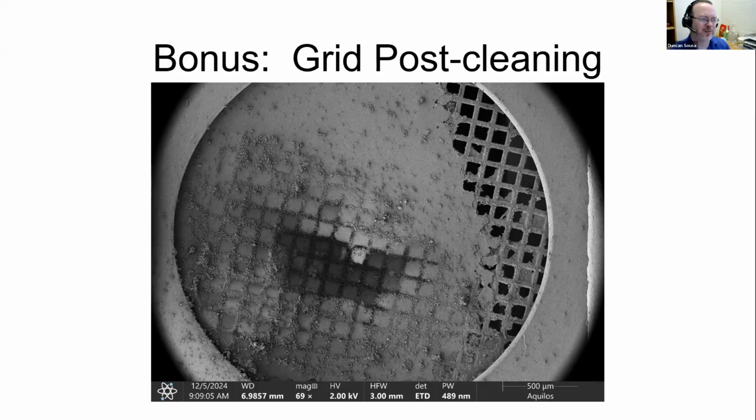Just like if you glow discharge something, probably even worse, because there's no oxygen or atmosphere to do chemical reactions and get rid of those radicals and highly charged things that you've produced. So anything nearby that's not attached to something is going to fly right toward it and stick. And the best thing to do is to not have anything that's loose and available for that to happen. So clean nitrogen.